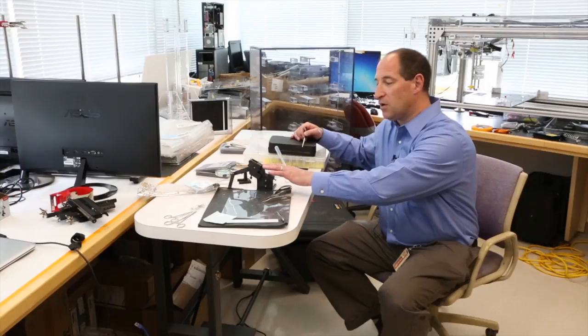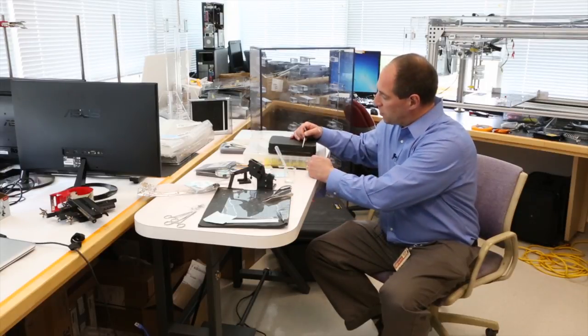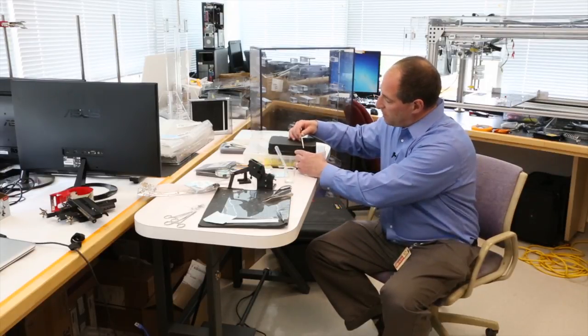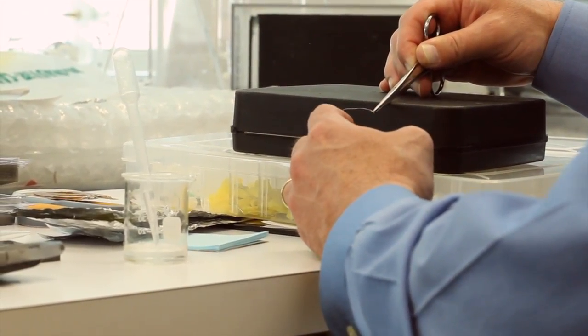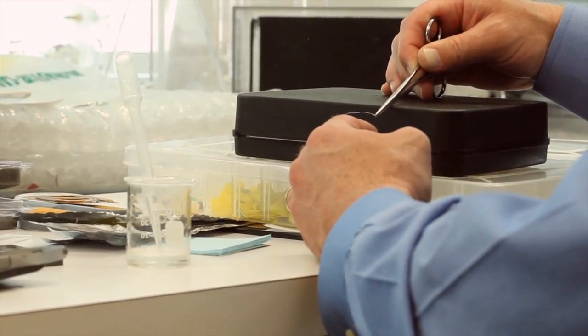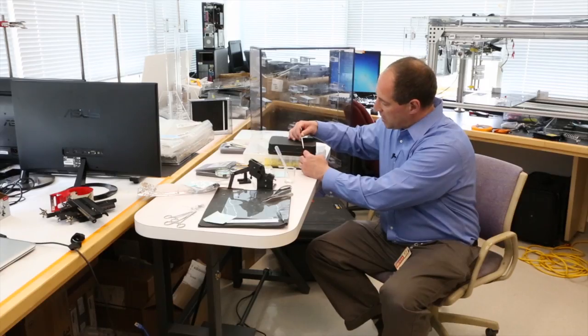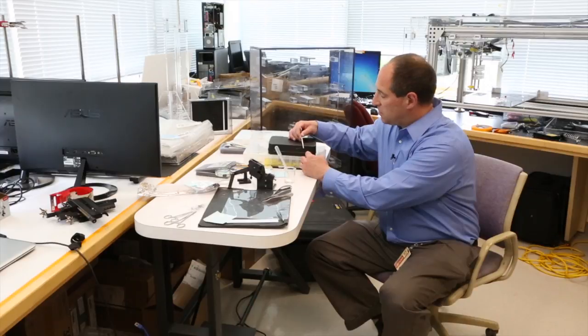We use this device here to crimp a needle on the end of the suture. What you see right here is the fibrin suture attached to the surgical needle. We need to keep track of the size and type of the surgical needle. This here is a three-eighth circle reverse cutting needle that we track.